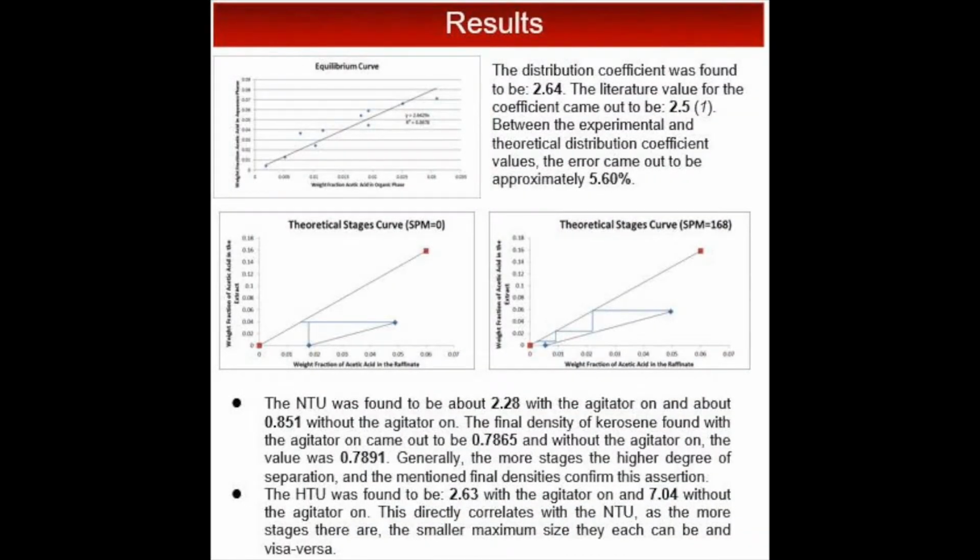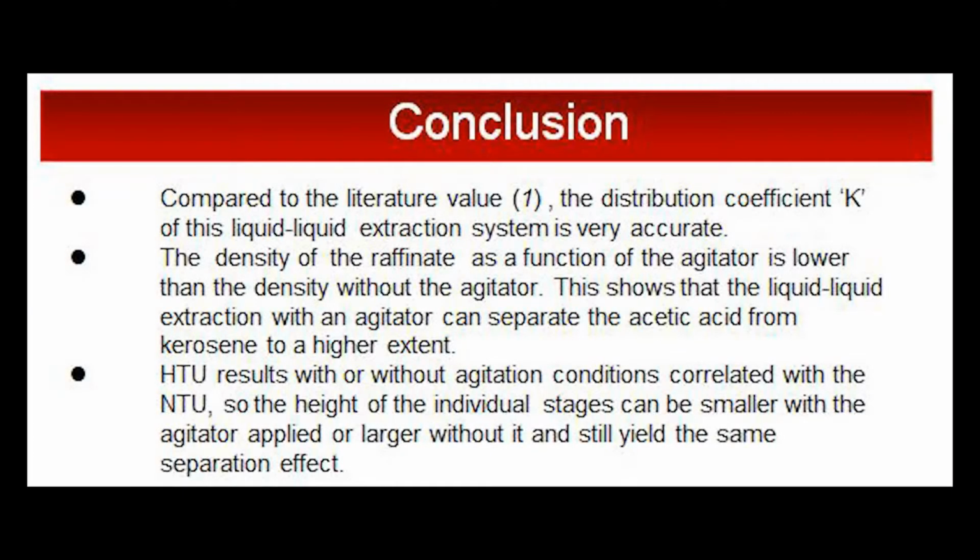So, if all of these safety measures, methods, procedures, and objectives are performed and utilized accordingly, a fully functional and comprehensive liquid-liquid extraction experiment will be simulated. Most importantly, one will learn the proper methods to optimize the separation, and a nearly pure kerosene product will be generated and ready to hit the market for immediate profit.